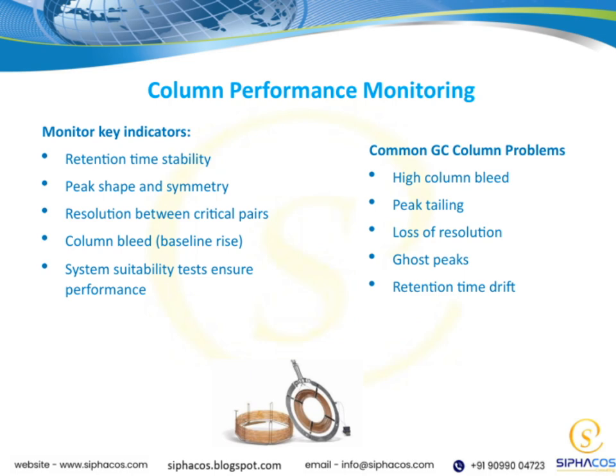And remember, system suitability tests are a vital part of quality control. They ensure your system performs as expected before you run your samples. Keeping a close eye on these factors helps maintain reliable, accurate results in your chromatography work.